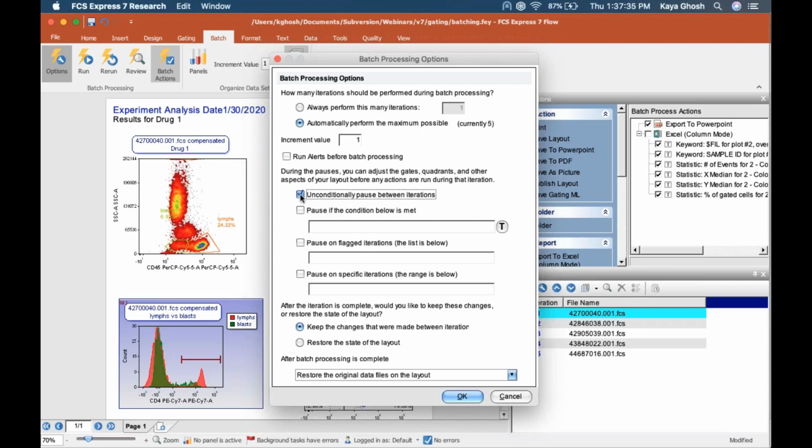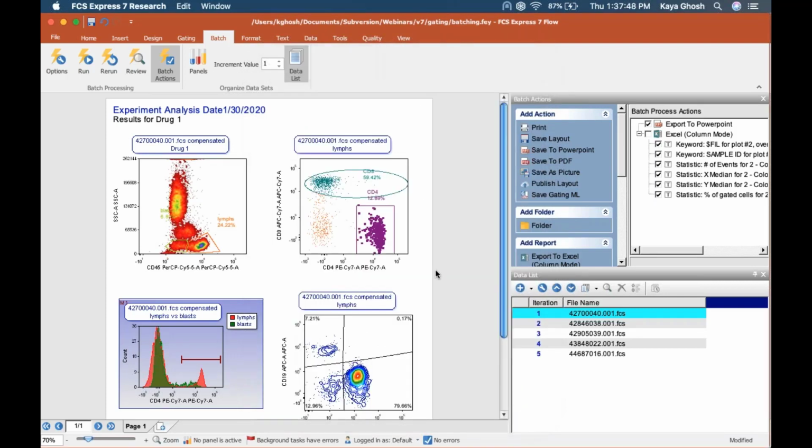And that, for those of you who are using that, because that's been there since at least FCS Express version 4, that will automatically record your iteration snapshots, just so you know. Okay, so don't feel like you have to change what you're doing. That still works. It's functionally the same as iteration snapshots.